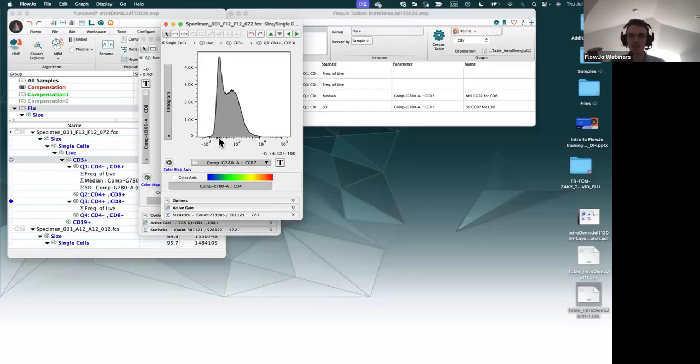Compensation does subtraction. It subtracts the false positive signal from the cells. So cells might have a slight amount of false positive signal in them that gets corrected by compensation. And then just due to the variance, the Gaussian peak should be centered at zero, but some of the cells might be slightly negative, but that's fine. As long as they're just slightly negative, that's fine. Okay, hopefully that answers that.